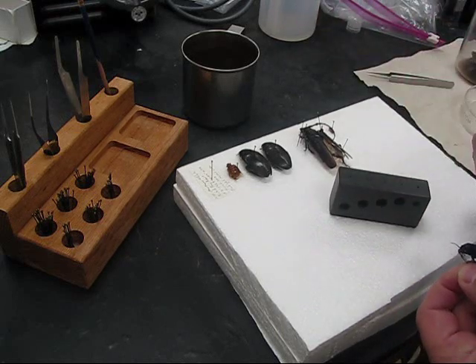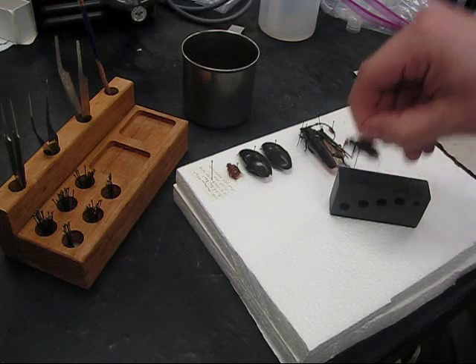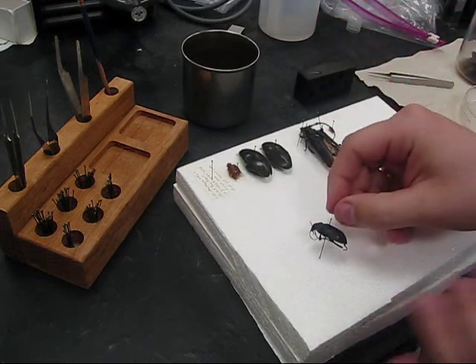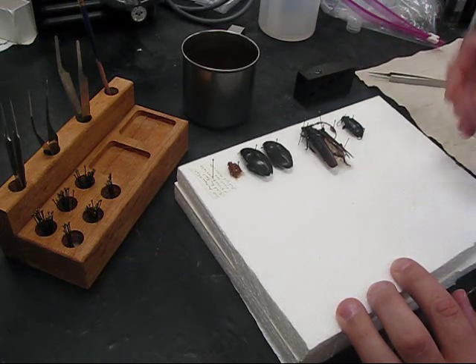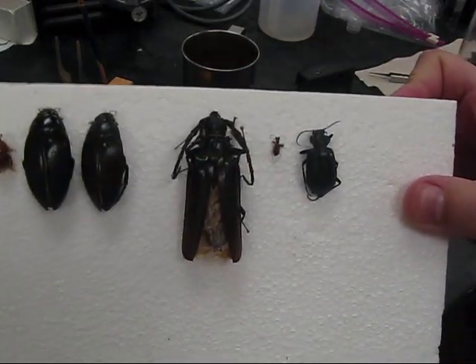Now I'm going to position the beetle on the pin using my pinning block, and now you can see that the beetle is at the proper height. To let it dry, I'm going to push it into the styrofoam, and that holds the legs up against the body.